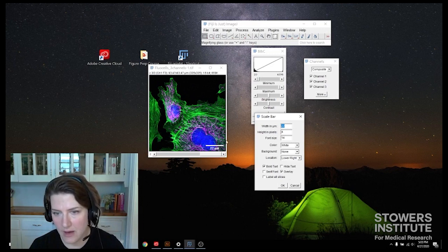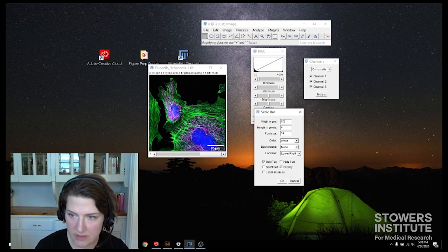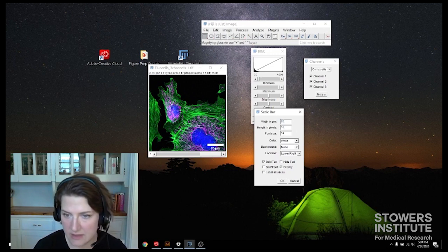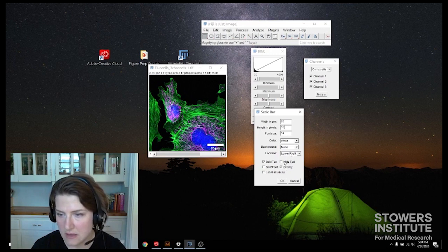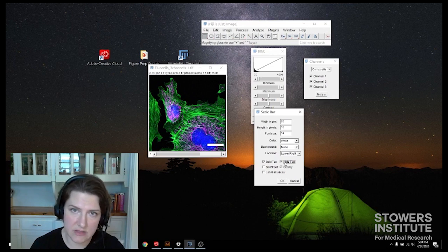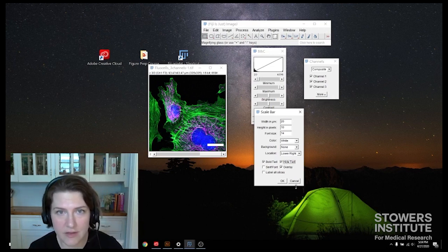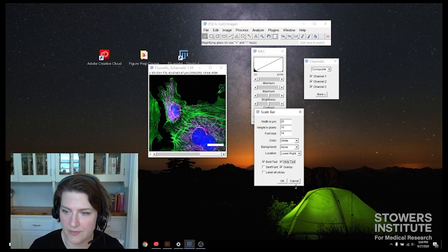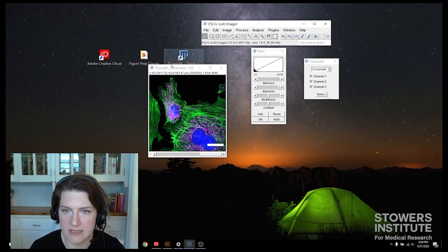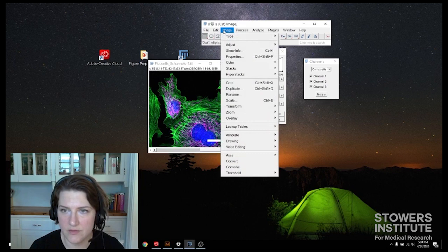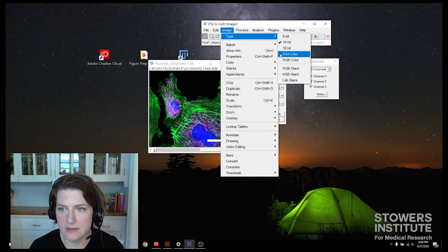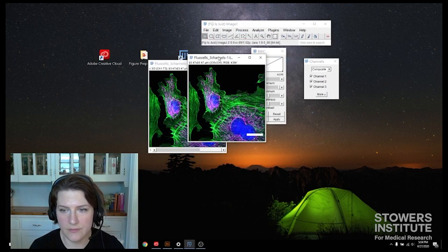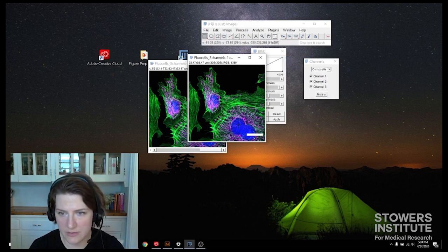So in the scale bar, I'm going to set it up. I want my scale bar to be 20 microns across. I want my height in pixels to be 10 because I want a nice juicy scale bar because this whole thing is going to be smaller. And then I don't want my text to show because I'm going to put the text in using Illustrator's text tools. And so I'm going to carefully write down that this text, the scale bar is 20 microns. And we also want to convert to RGB for our multicolor image before we copy it.